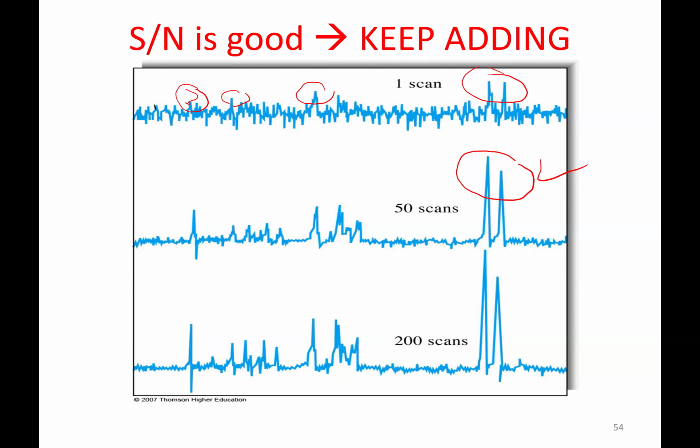Everything is acquired at every 4 wave numbers. I'll tell you, acquire 4 scans. Are we together? And then if I see the peaks are not well defined, I'll tell you, maybe go to 8 or 16 scans, all right? That means you are acquiring more spectra, adding them, and you are improving the signal-to-noise ratio.